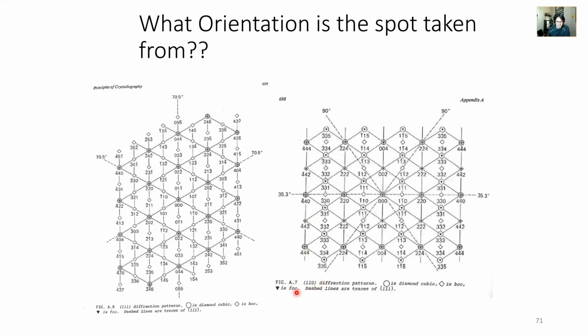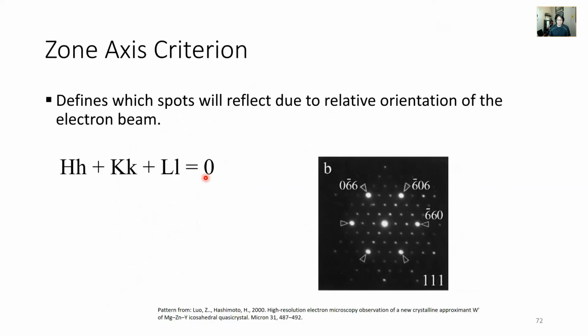But yeah, I was taken aback by this error. Zone axis is a direction, folks, so this should be a hard bracket, and not the parentheses. But anyway, you see tables like this in different books and articles and stuff like that. And so there are these published arrays. There's, again, computer software, and I'll be honest, I'm not that familiar with crystallography computer software.